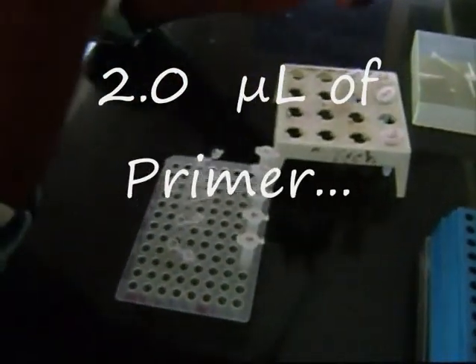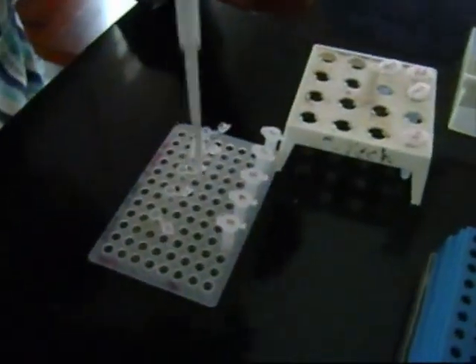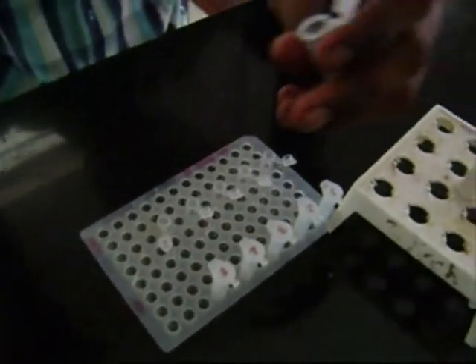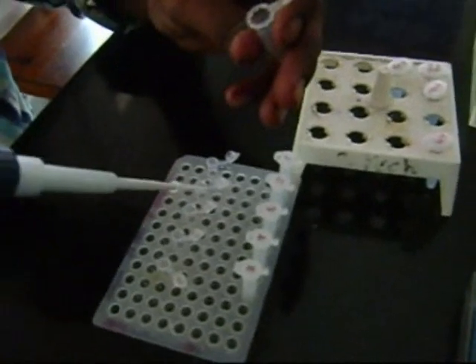2 microliter of primer is added to each tube. The primer first hybridizes to the complementary sequence of the single-stranded DNA and helps in initiation of the reaction. Here, the primer sequence is carefully picked from the repeat sequences abundant in the particular species.